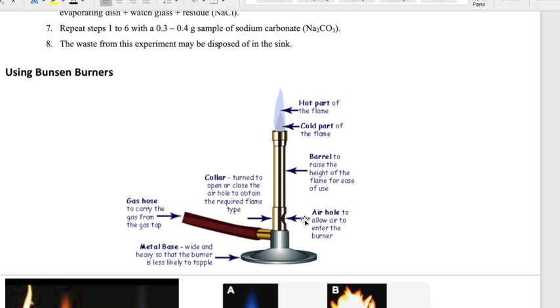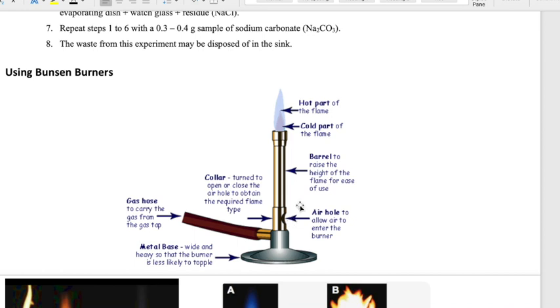The air hole allows oxygen — or air, which contains oxygen — to come in. A flame will not turn on without oxygen since combustion cannot occur without it. If you close off the air hole, the Bunsen burner will die and there will be no flame, so it has to be slightly open.